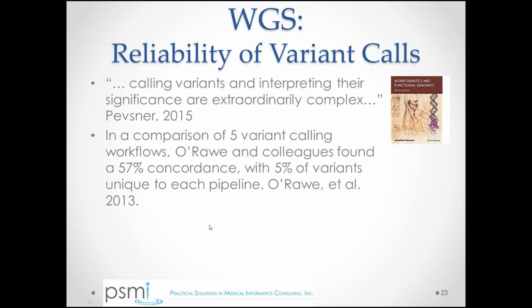So again, I'm going to kind of leave it at this. I wanted to leave you with a qualitative sense, at least, of the complexity involved. It's not just, oh, let's do next generation sequencing, and boom, you have this nice pretty list of 3 billion bases, and that's your genome. Rather, what you have are these sequence alignment files, and you have these VCF files, and they have some inherent challenges in them, and so they have to be taken with a little bit of a grain of salt.